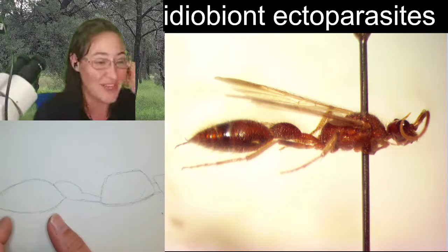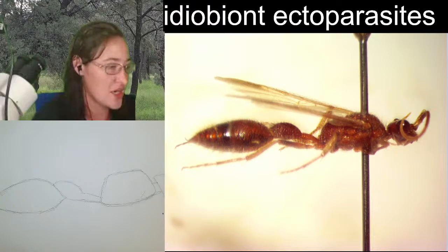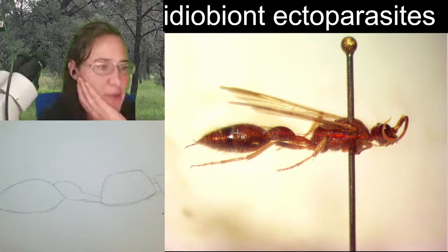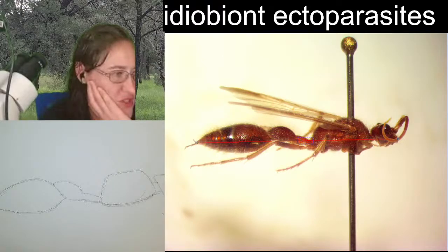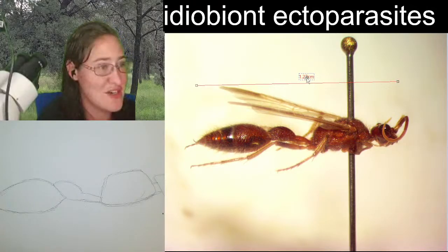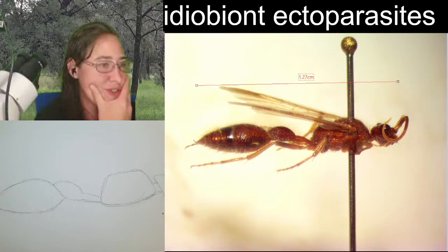Does the length include the entire stinger? You know what? Let's get a measurement from a lateral point of view, because from the top, we couldn't see what we were looking at right there as the stinger. So, if I don't include the stinger, and it's not a stinger, by the way, it is male, so it doesn't have a stinger, without that abdominal appendage, it is 1.27.